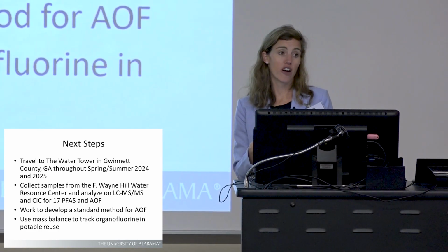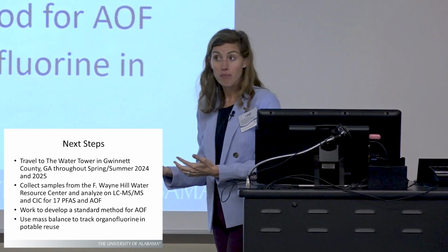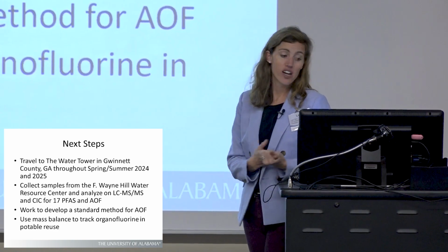Combustion ion chromatography is typically a little cheaper and easier than LCMSMS, so maybe it could be more useful for utilities. We'll investigate to figure out if that's the case.